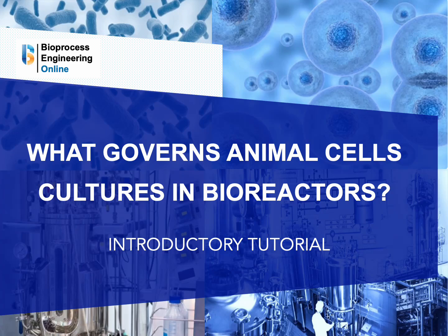Welcome to our introductory tutorial, What Governs Animal Cell Cultures in Bioreactors?